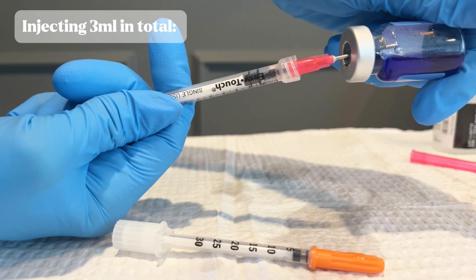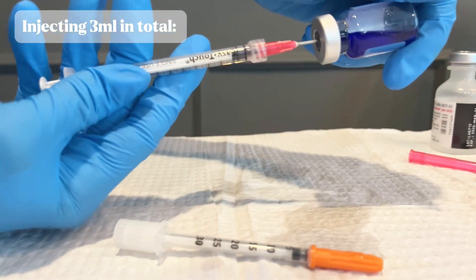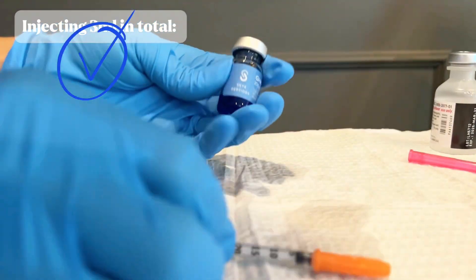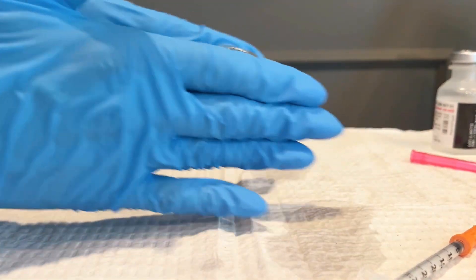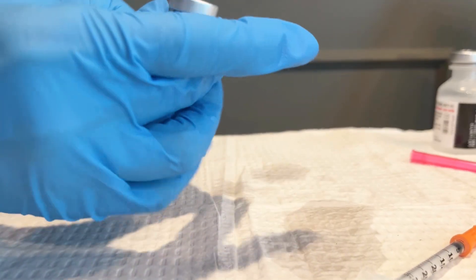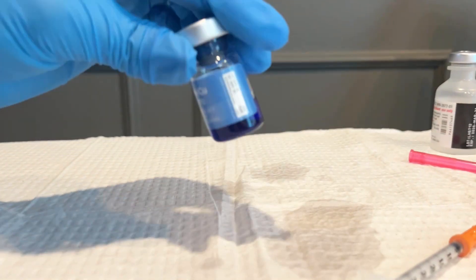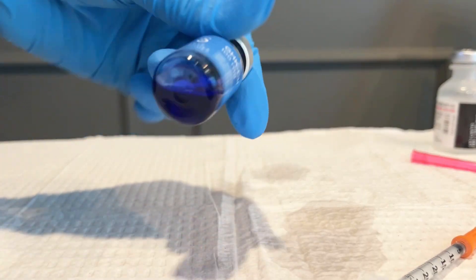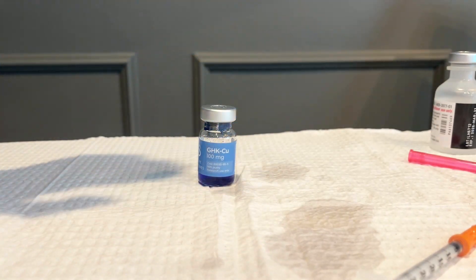I'm filling the syringe 3 times with exactly 1ml each time, injecting it slowly into my vial. Once I have all 3ml in my vial, I'm going to give it a gentle mix — always being gentle. I'm then going to place this in the refrigerator so it's protected from light and kept cold. It's going to sit for 1 hour to fully dissolve, so when I'm ready to do my first dose, everything is equally dissolved and I'm getting an accurate dose.